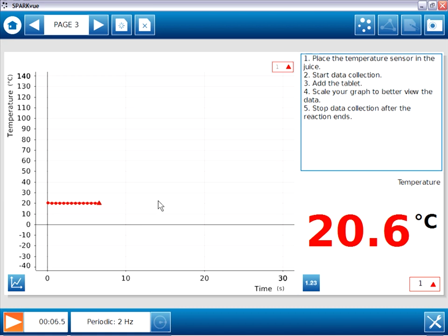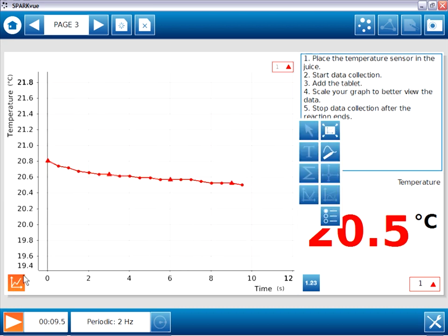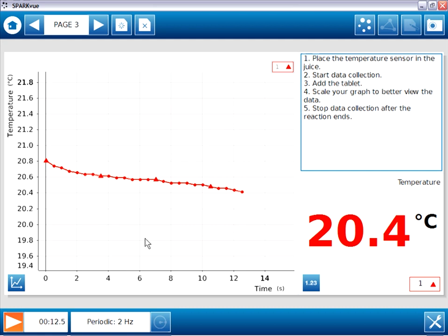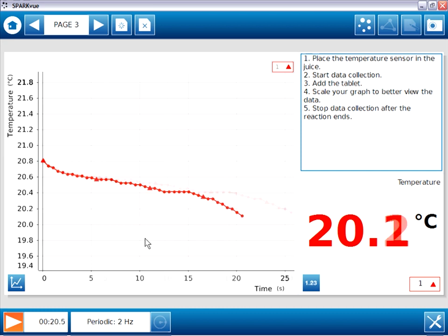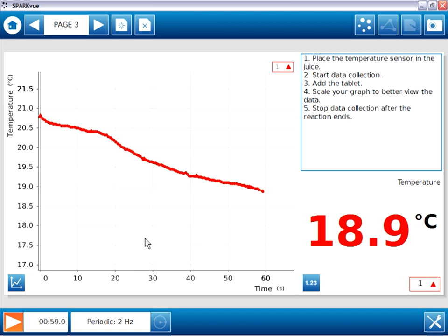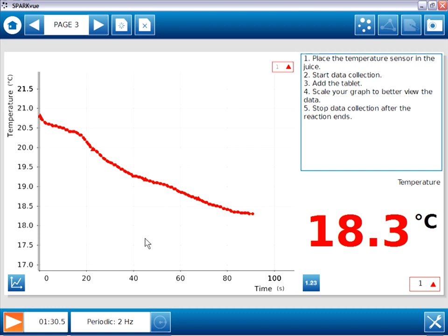And I'll add the tablet and scale the graph so we can better see any changes in temperature. And it looks like I'm beginning to see a decrease in temperature. So I'll let that run until the reaction ends. The temperature is stabilizing. The bubbling is stopped. So I'll stop data collection. And it looks like page three works as intended.